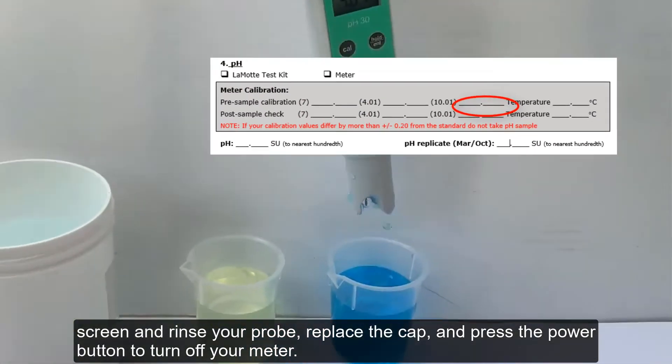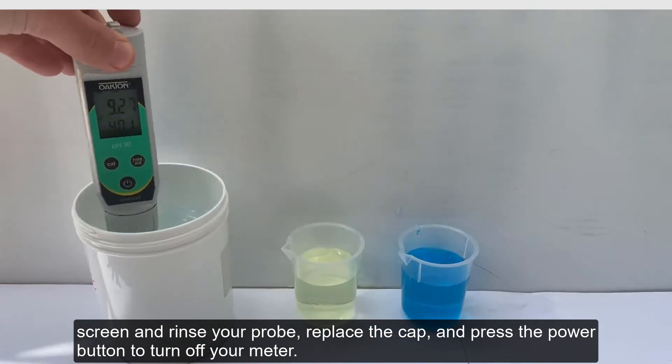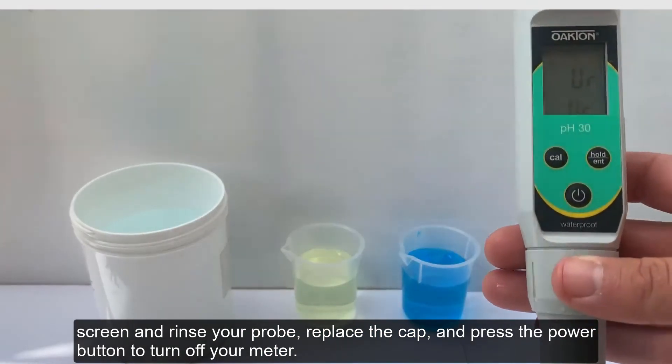Record the number that flashes on your screen, then rinse your probe, replace the cap, and press the power button to turn off your meter.